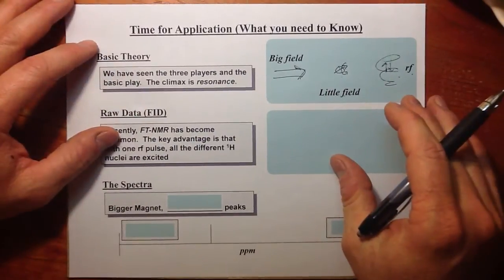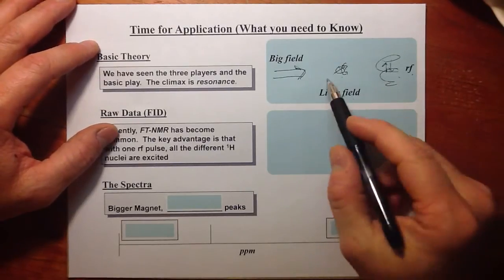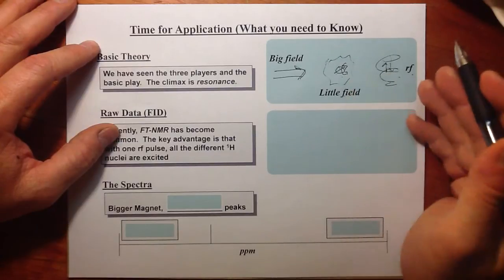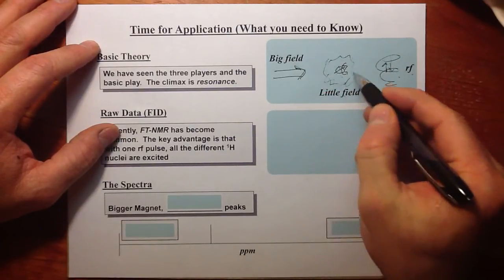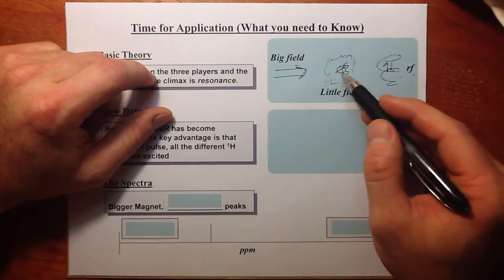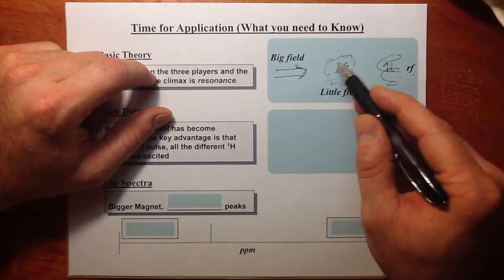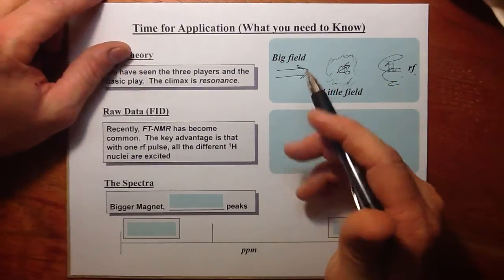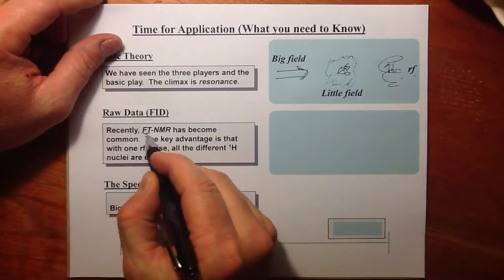Something we didn't touch on that is new is we can actually, even though there's some amount of electron density around each proton in a sample that's differing, my little cloud of electron density, we can apply a short pulse of radio frequency that excites all the little fields regardless of the difference in shielding they have. So all of them get excited. That's a more current method of NMR.